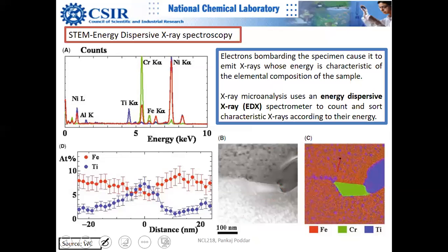If you do not take this image, and most of the time students take only the other image. I was scolding one of my students who works on dyes, that you're not doing the color mapping. This is the disadvantage if you do not do that, because you will notice some changes here. But I told you that a change in the contrast can be due to three things. I am repeating it for the 10th time probably in this class itself: crystallinity contrast, and mass contrast, where mass means atomic mass or atomic number, or thickness.